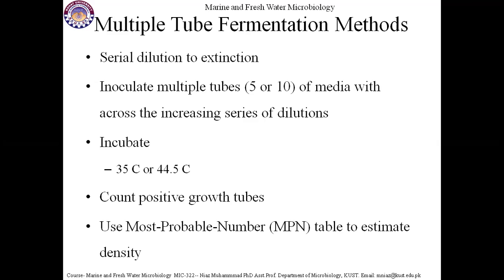Use the most probable number, MPN, table to estimate the density, and we will perform this practical in the lab when physical classes resume after some time.